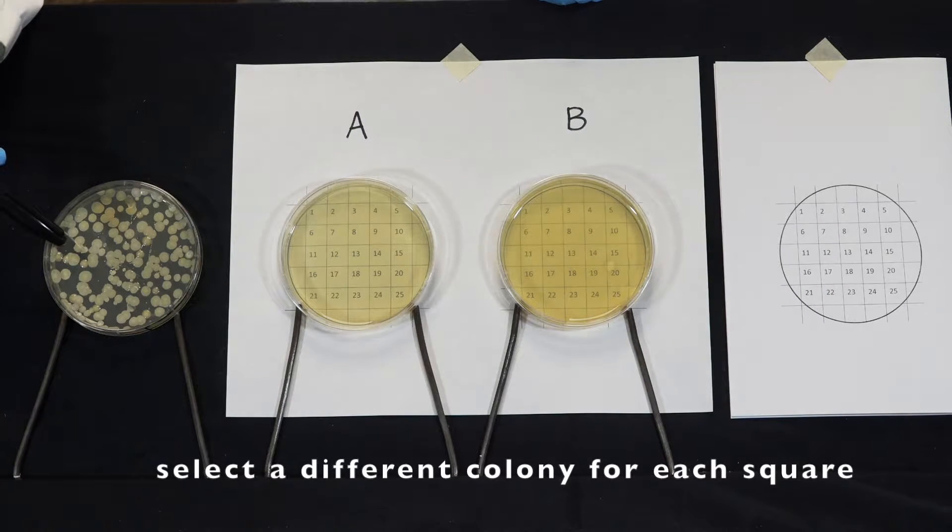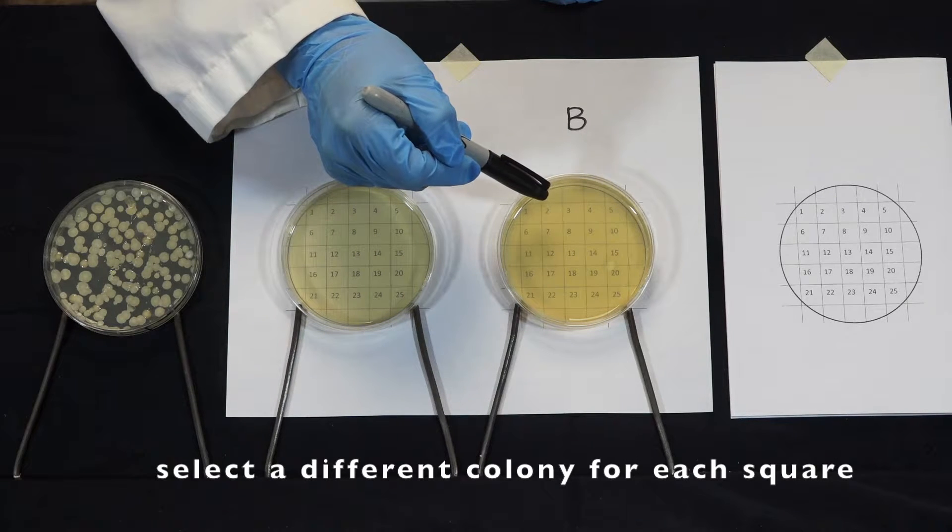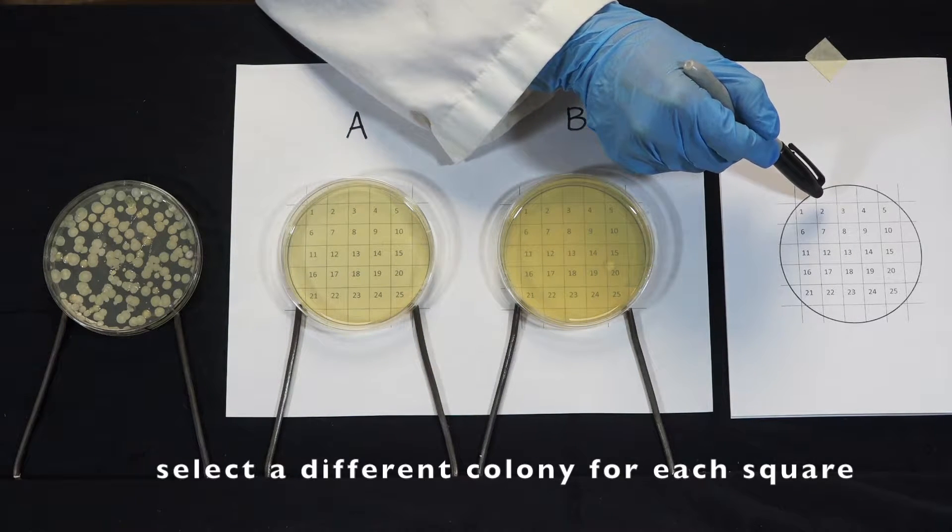We'll pick a second colony from this plate and inoculate square two on plate A and square two on plate B. And then mark off that we've inoculated square two.